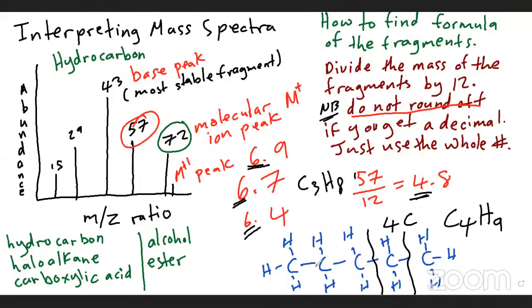Look at this here. For the first 3 carbons, it has 3 and 2, 5 and 2, 7 hydrogens. Because this bond here is to a carbon. So that is the reason why you should always have 1 less hydrogen, because you are always breaking carbon to carbon.